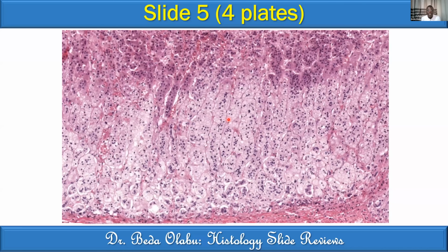So the adrenal cortex contains 3 ill-defined zones. They're not well-defined. The outermost zone, the one that is below the capsule, contains cells in cords, but those cords are arcing. Look at that one, rounding, arcing cords. That's the zona glomerulosa, which produces mineralocorticoids.